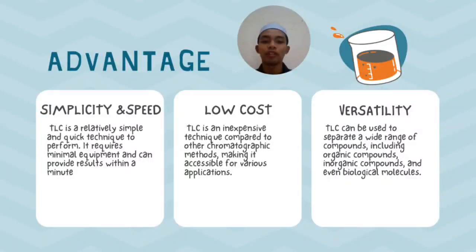And the last one is versatility. TLC can be used to separate a wide range of compounds, including organic compounds, inorganic compounds, and even biological molecules. By adjusting the stationary phase and the mobile phase, TLC can be adapted to separate compounds with different polarities and properties.